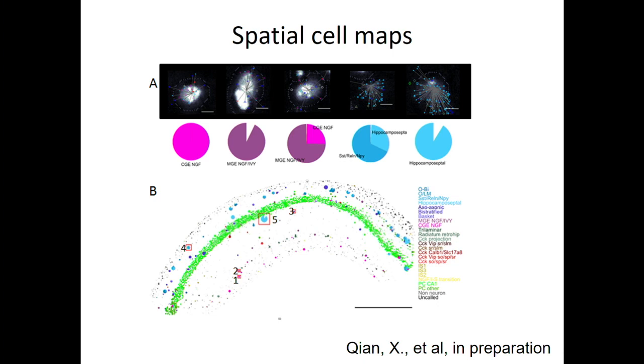And then we map these pie charts onto the DAPI image, basically, of the brain. And here's a complete map of CA1 of mouse hippocampus, and we can provide identity to the absolute majority of the cells in this tissue, according to these definitions. This is about the 20 cell types of neurons that we want to map.